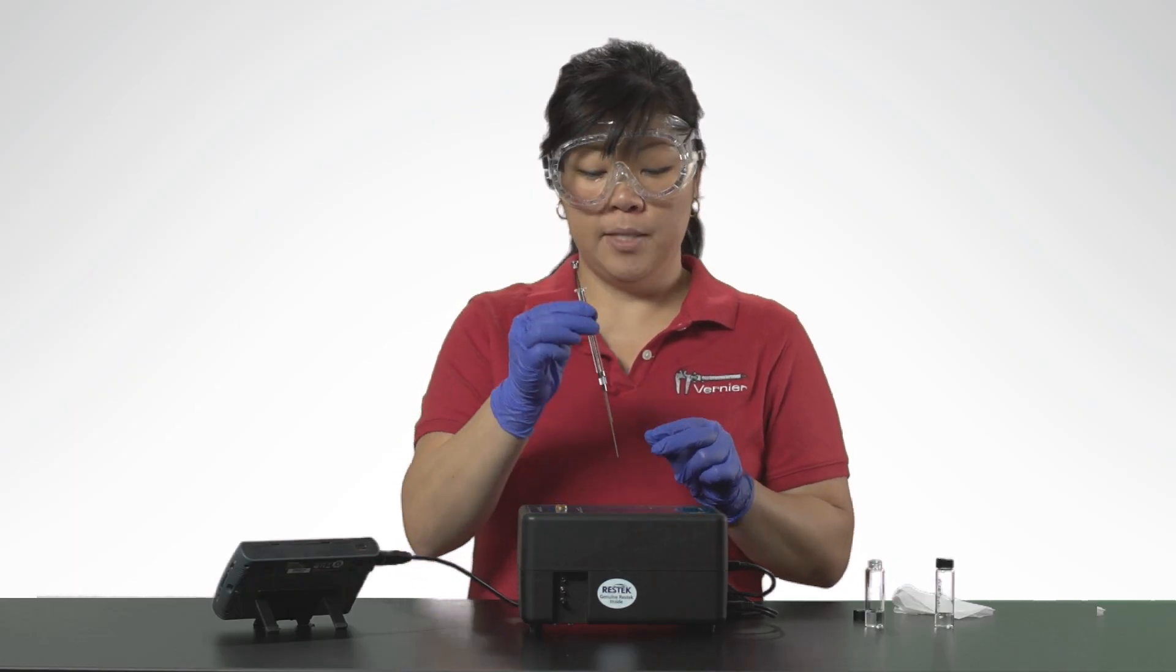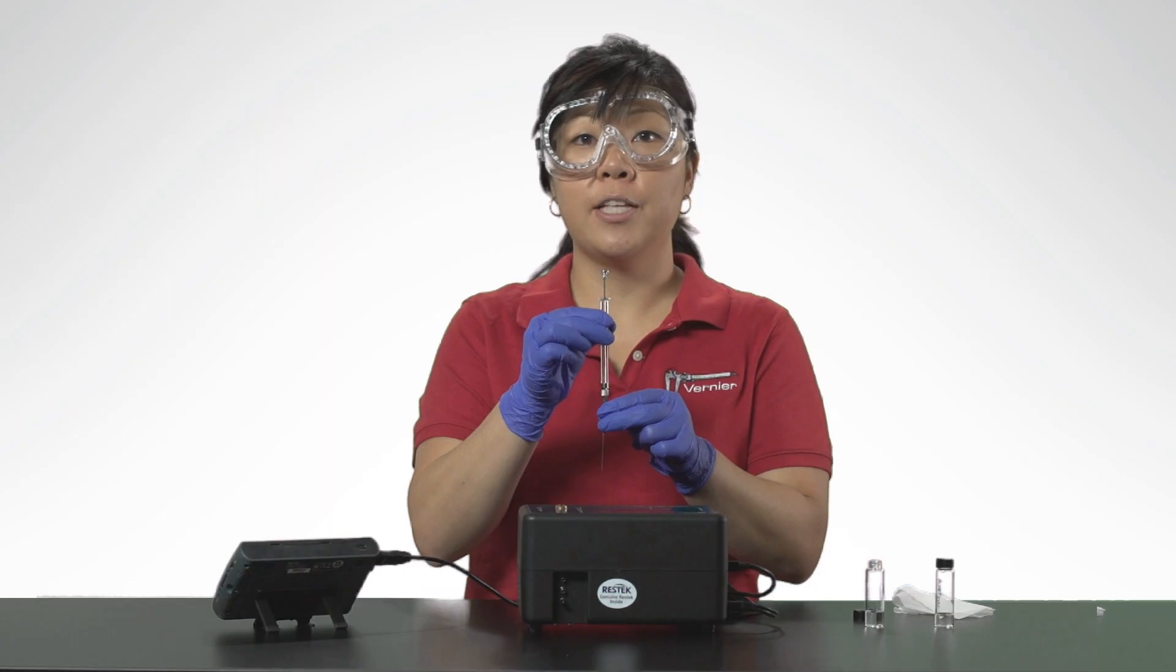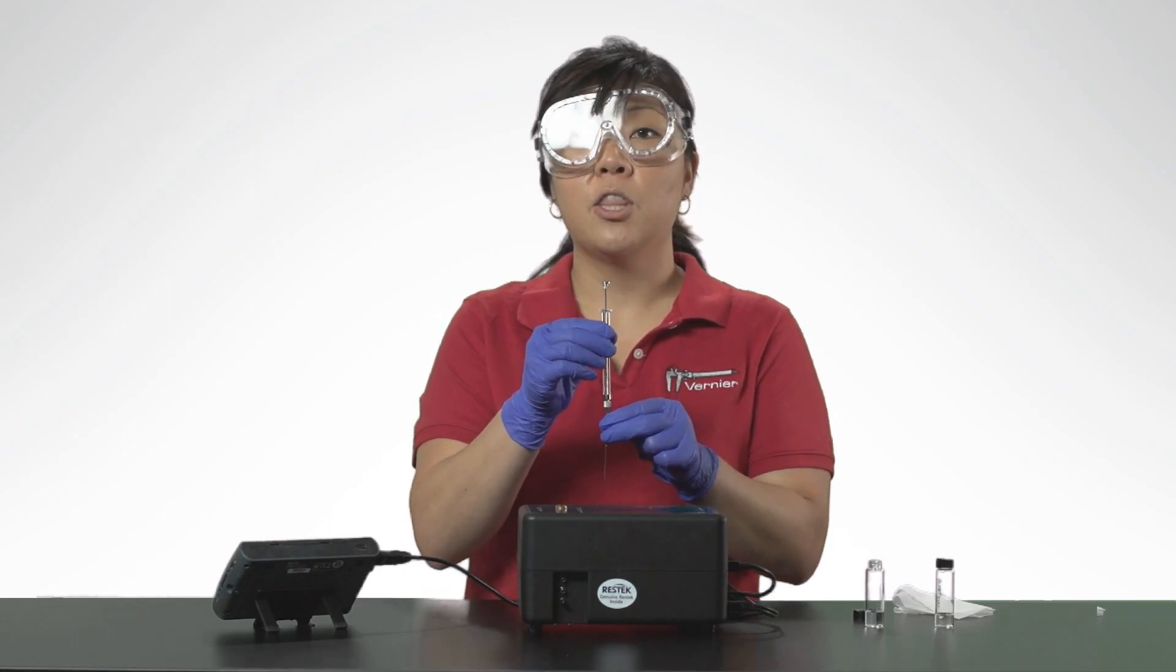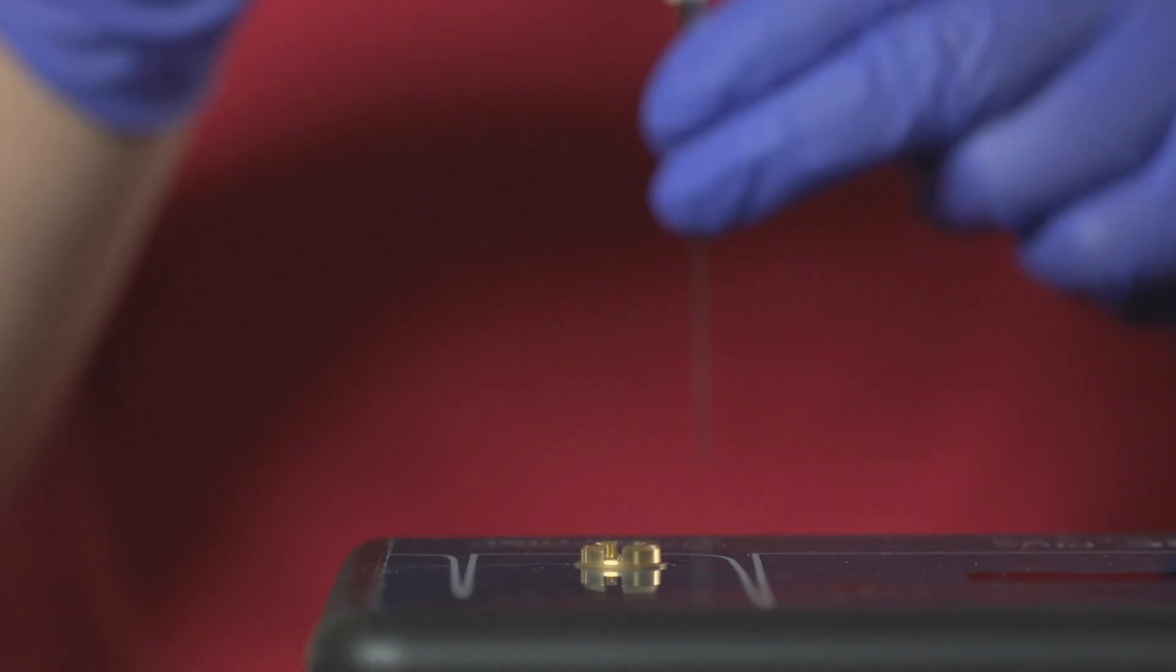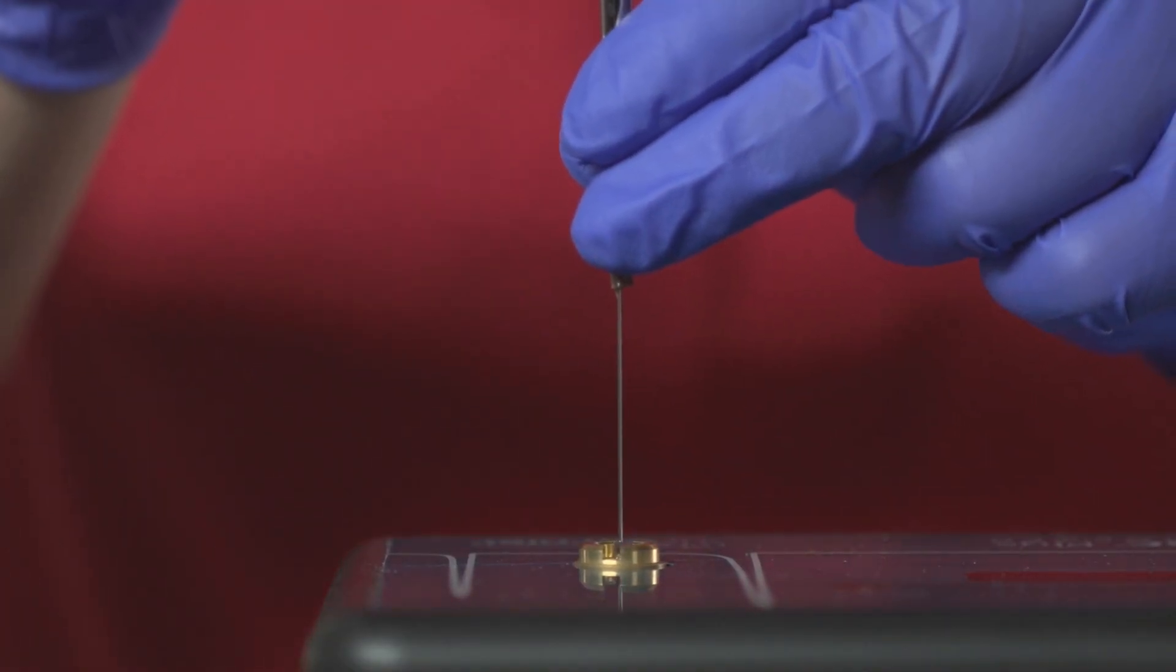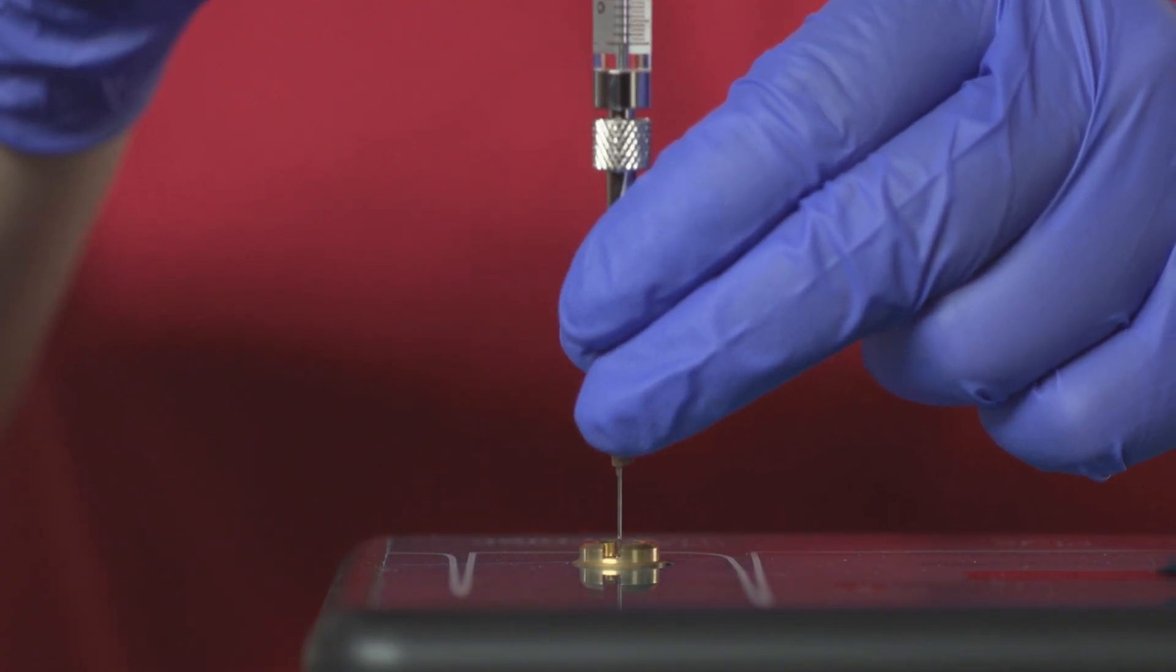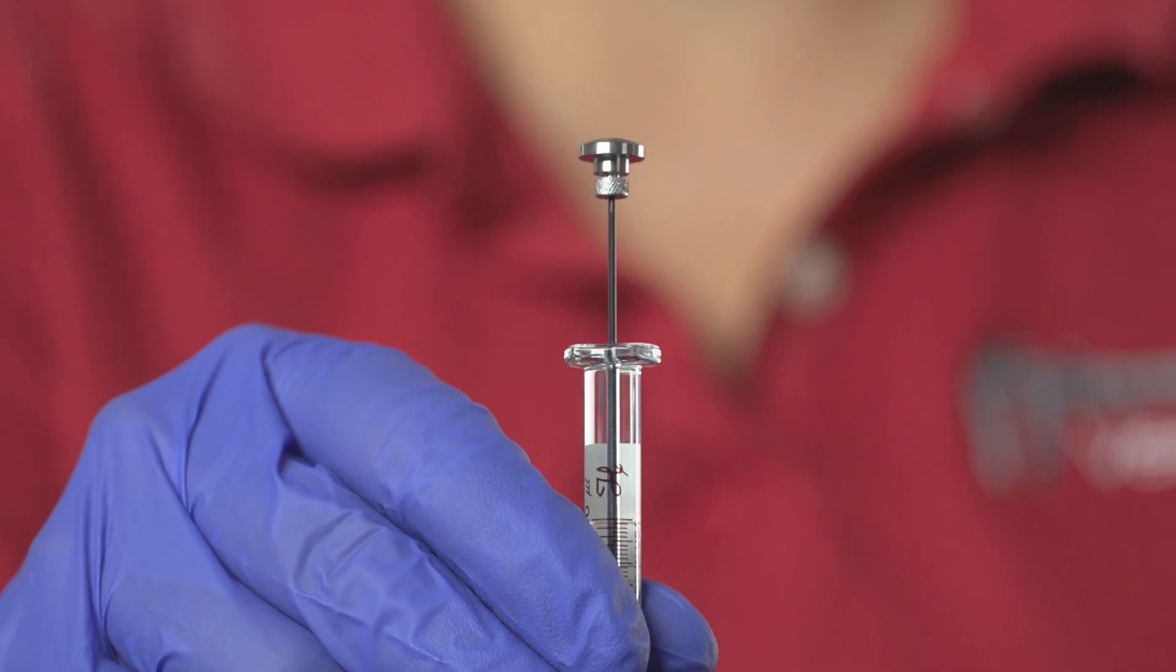Hold the syringe with one hand. Steady the needle with the other hand supporting the needle guard and the lower part of the needle with two fingers to prevent the possible bending of the needle. Insert the needle into the injection port until the needle stop is fully seated. If the needle sticks, rotate it slightly while inserting. Do not move the plunger yet.